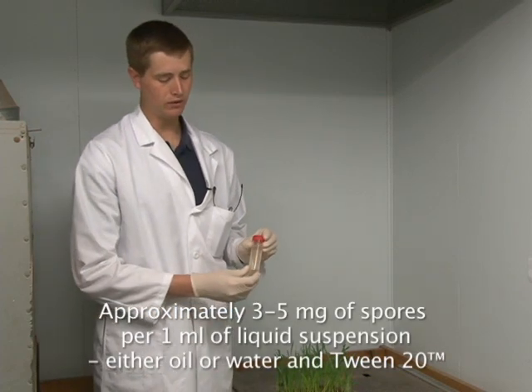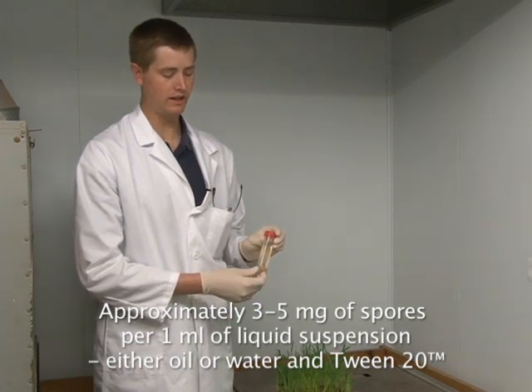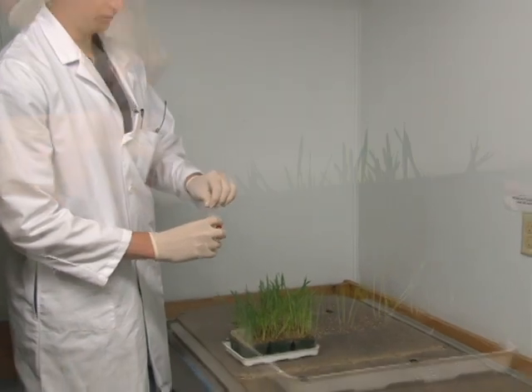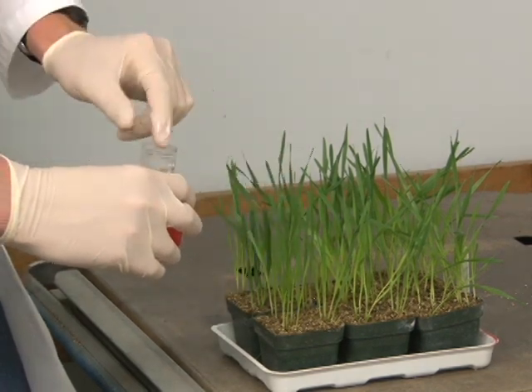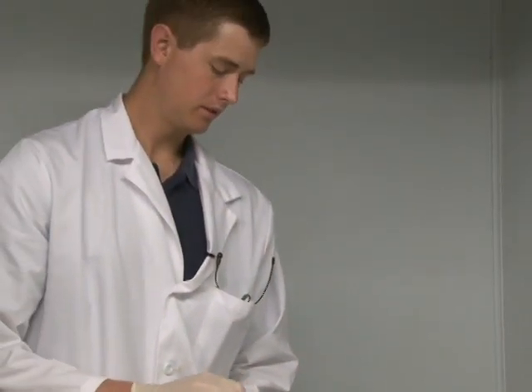Now I'm going to talk about the method of hand inoculation of rust onto plants. If you have an oil solution that is a fresh mixture of oil and spores, you can simply get your finger wet with that solution and wipe down the primary leaves of the plants that you would like to inoculate. This method of inoculating plants is effective, but as you can see it's relatively slow.